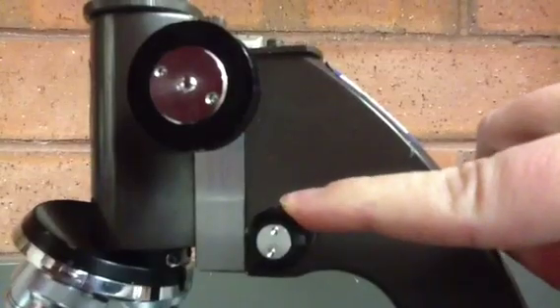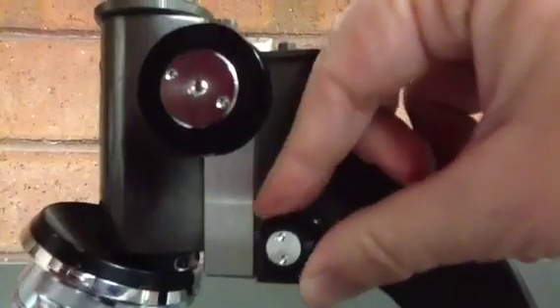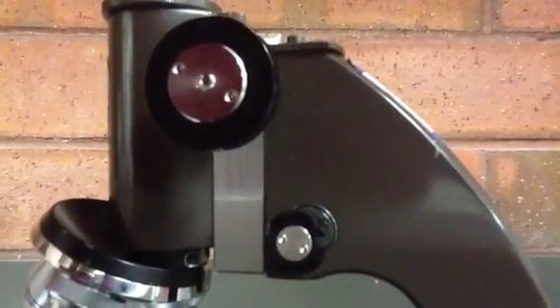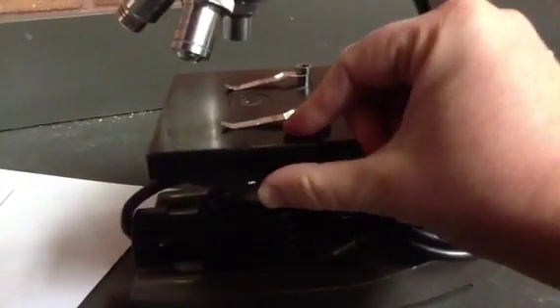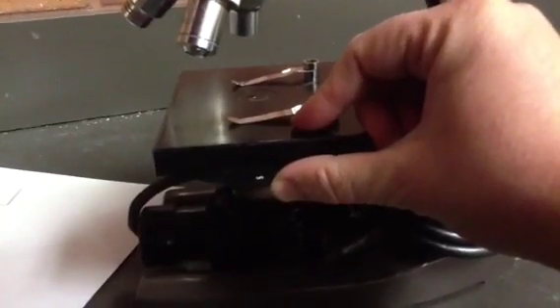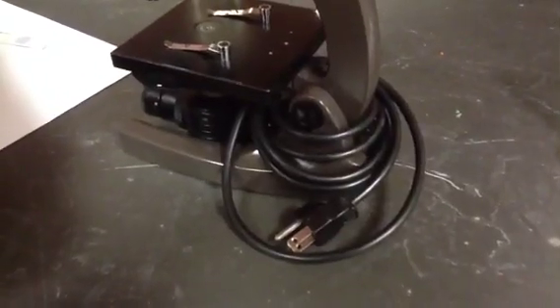This knob is called the fine adjustment knob or the fine focus knob. This one does very small movements in order to sharpen the image that you're trying to look at. The small adjustment knob is the only one that should be used when your microscope is on the high power, which is the longest objective lens. This part is called the diaphragm. It rotates in order to regulate the amount of light that will get through. This is the base of the microscope. It supports the microscope.